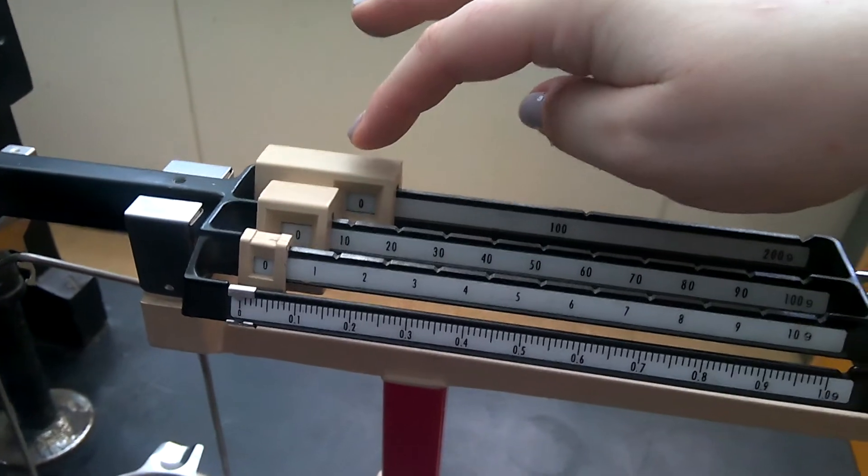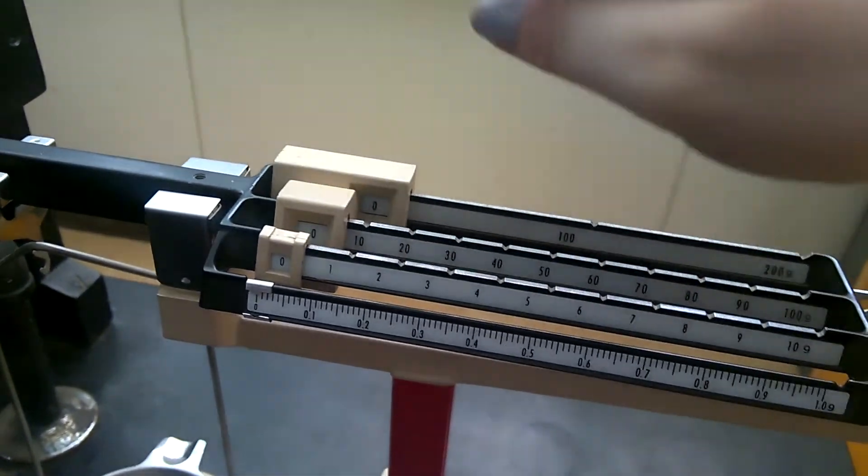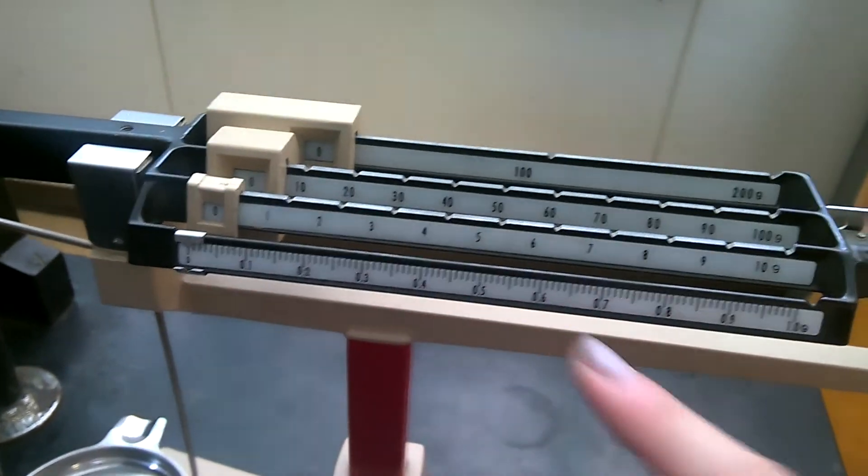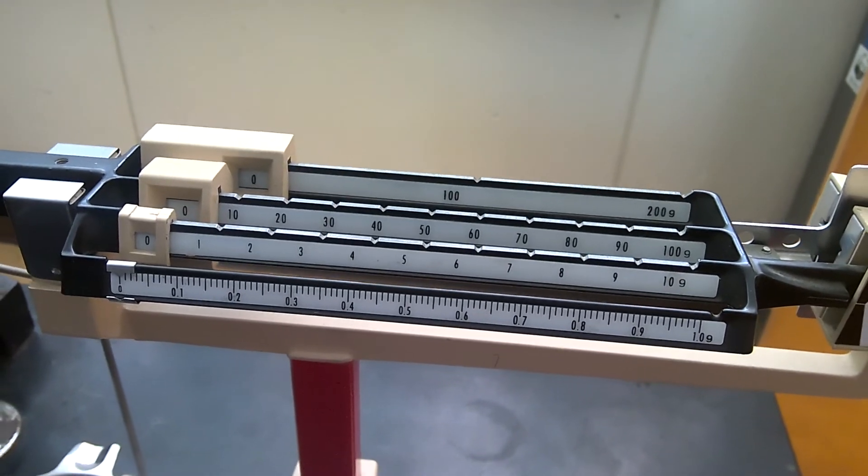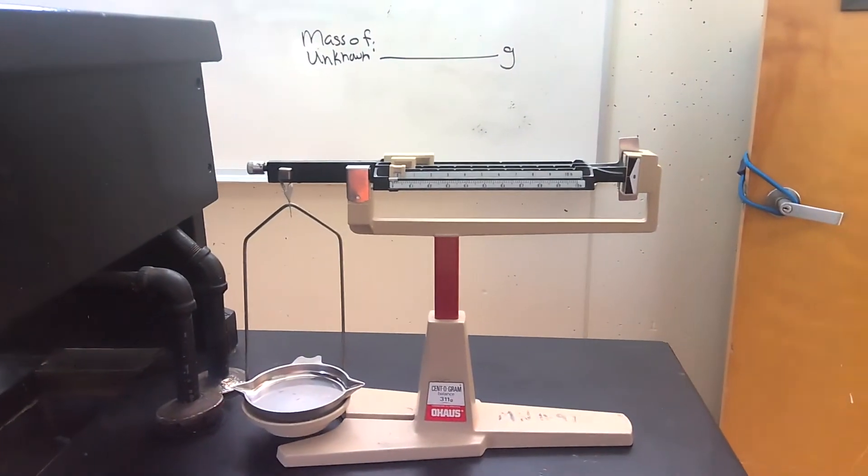So the back one is the hundreds, then the tens, and then the ones. And then you get to the numbers that are going to be past the decimal and we use those numbers to get precise measurements of objects, substances, and chemicals in chemistry.